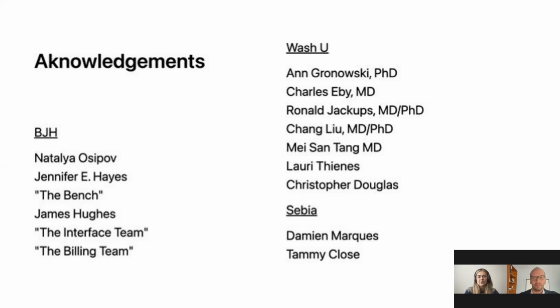Next question here. Which LIS do you have? We enter interpretations in Epic Beaker. We are using Cerner Millennium, and our EHR is Epic.